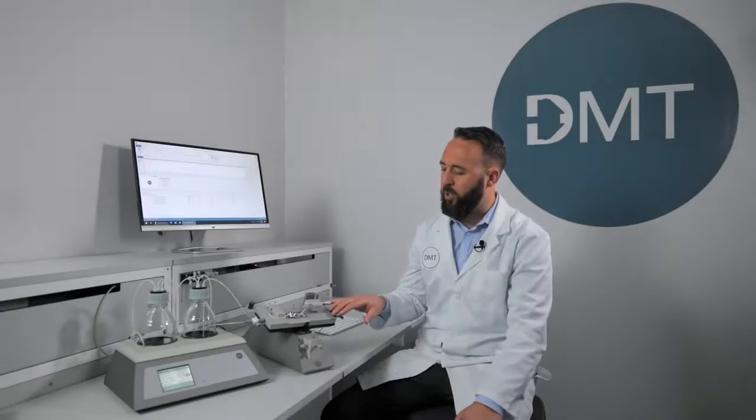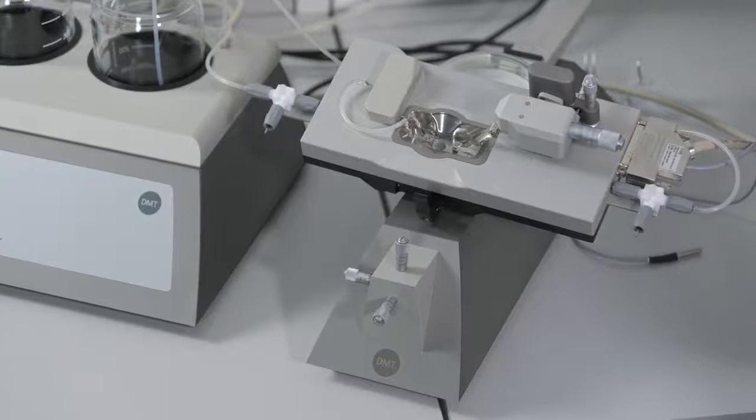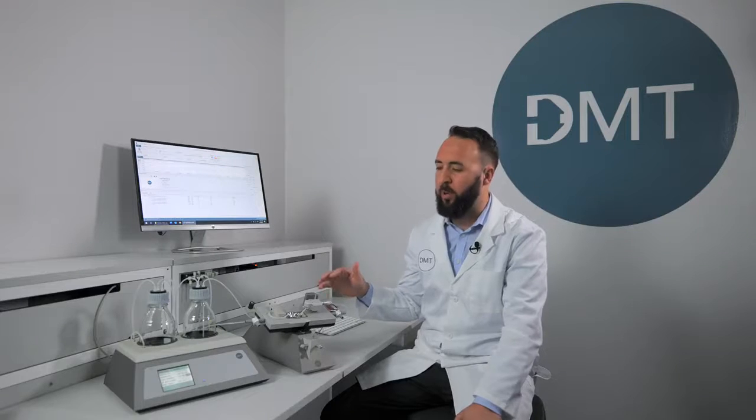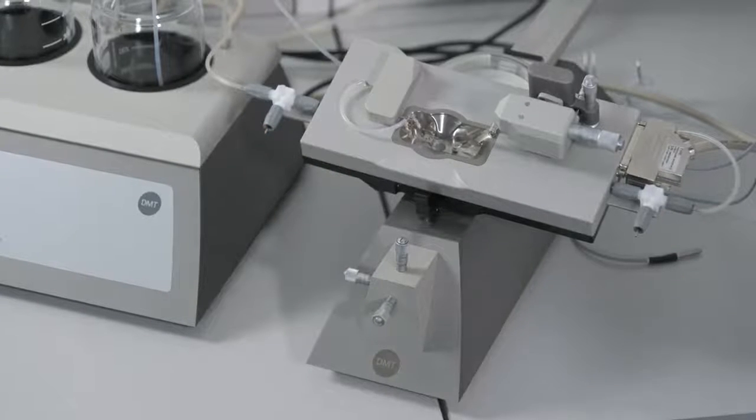When looking at the 114 chamber, you will see it has a connection that will go to the pressure interface. This allows for communication back and forth. There are two three-way valves that allow you to control the direction of pressure and flow in your chamber.